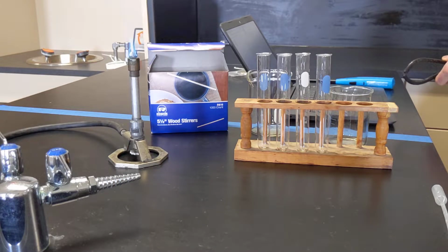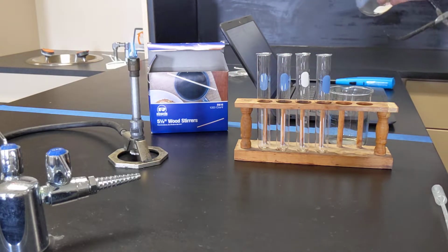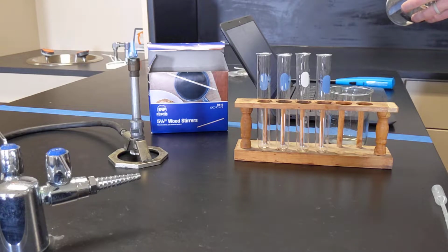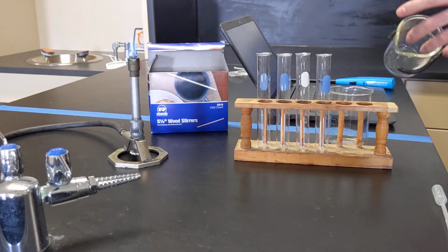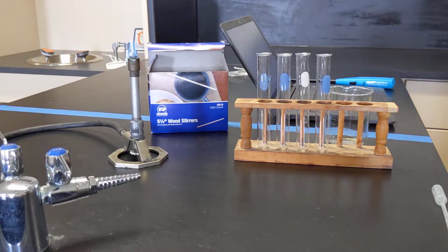Okay, so reaction one, I already have the Bunsen burner lit, and it says I'm supposed to hold a beaker above the flame upside down for 5 to 10 seconds, taking observations of what I see. The procedure says that the chemicals being used here, the natural gas is methane, which has the chemical formula CH4. It is now currently, hopefully you can see the blue flame there, reacting with oxygen in the air.